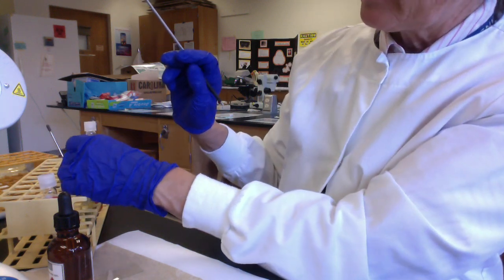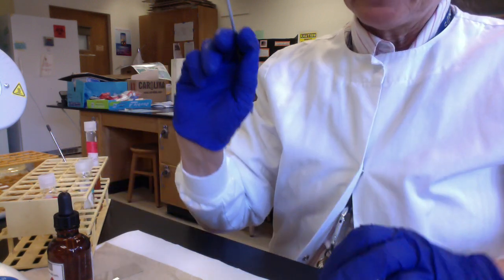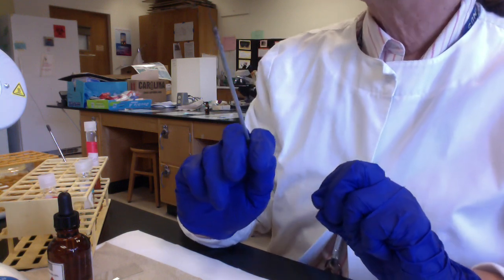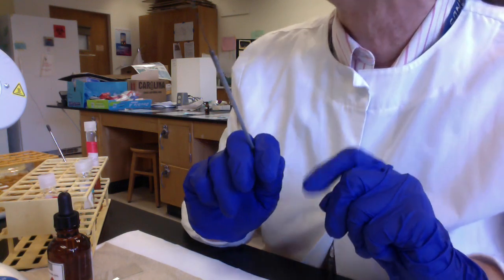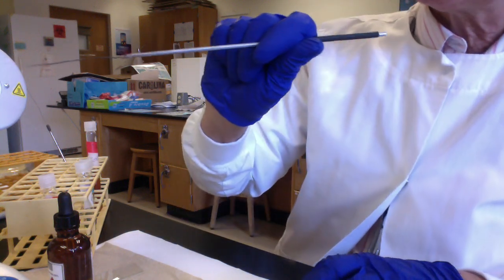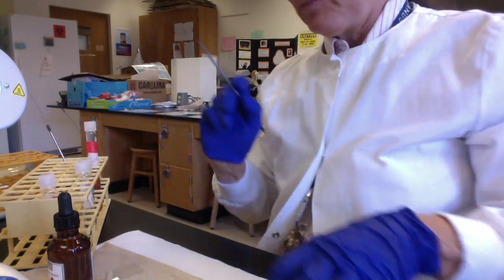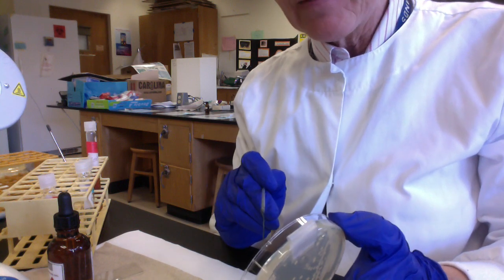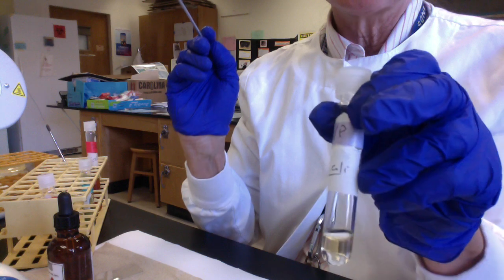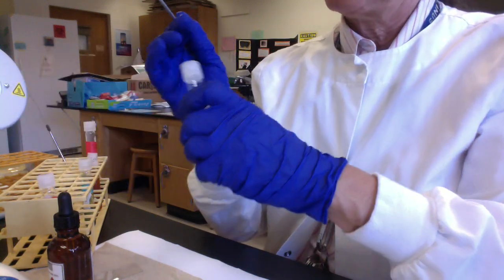In the MViC test, the third test, the V, is called the Voges-Proskauer test. And this is a test to see if our microbe uses a different fermentation pathway, the 2,3-butanediol fermentation pathway, or butylene glycol fermentation pathway. And so it's in some ways similar to the methyl red test. Okay, I'm going to harvest my E. coli. Okay. I'm going to take my VP broth, and this is actually the same broth as methyl red, just a high glucose broth. Okay, I'm going to inoculate.